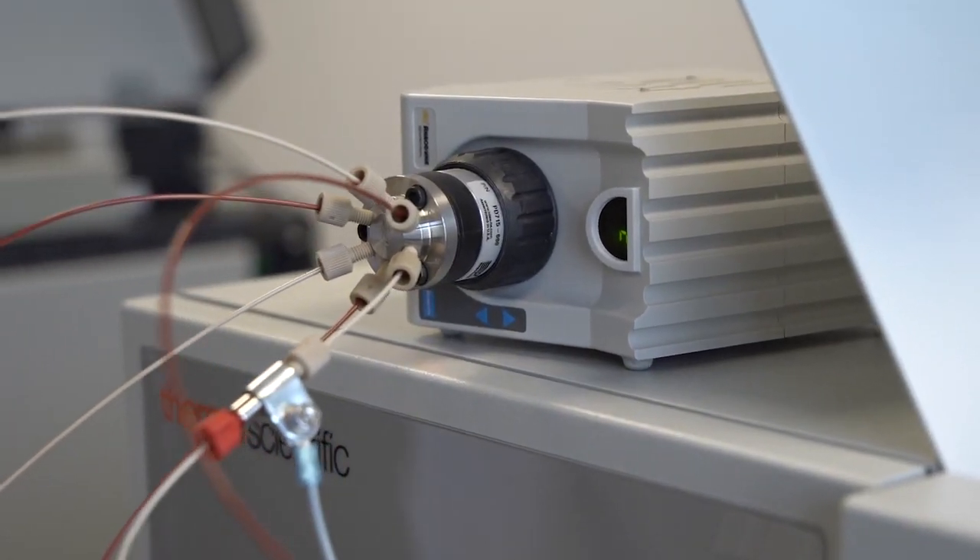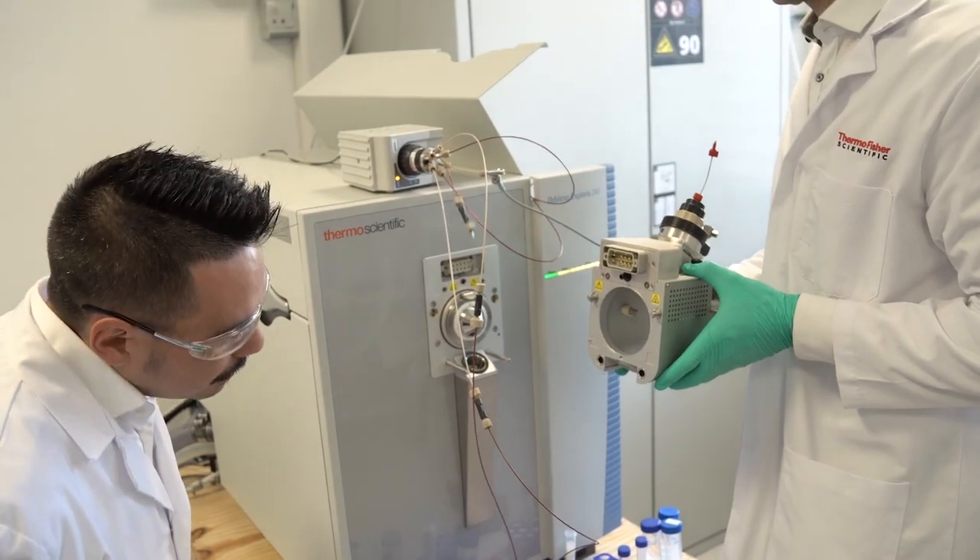To couple the dual syringe inlet system to the Orbitrap Explorers mass spectrometer, we use electrospray ionization sources. The electrospray ionization source allows to ionize nitrate as intact molecular ions and transfer them into the gas phase.